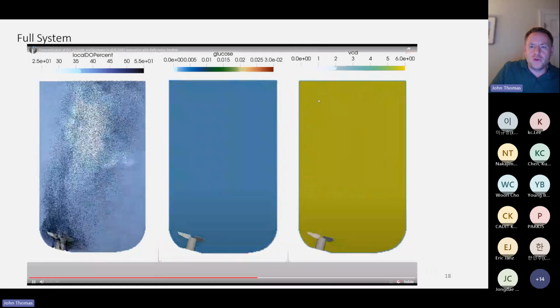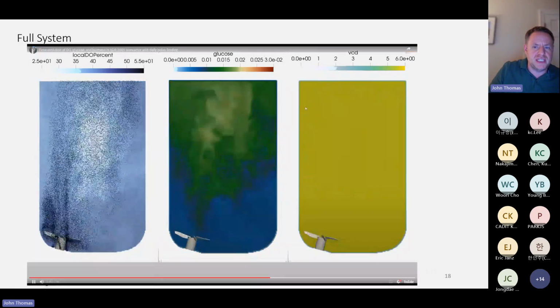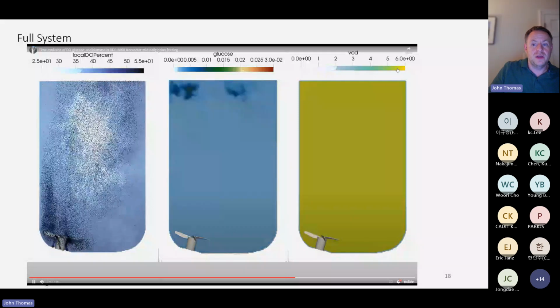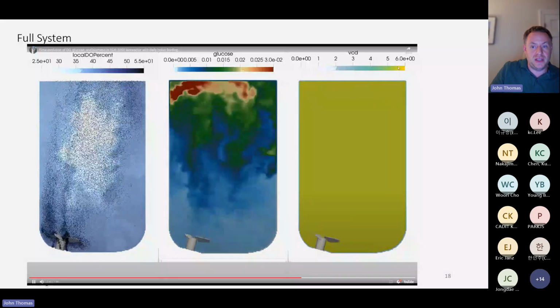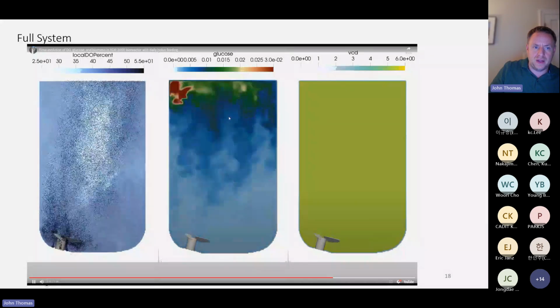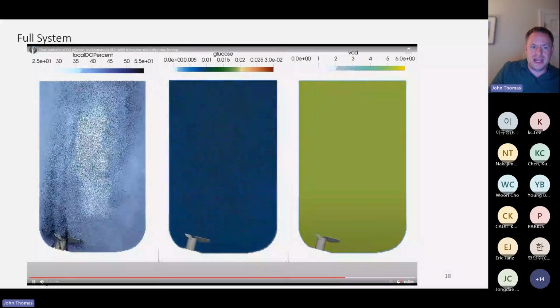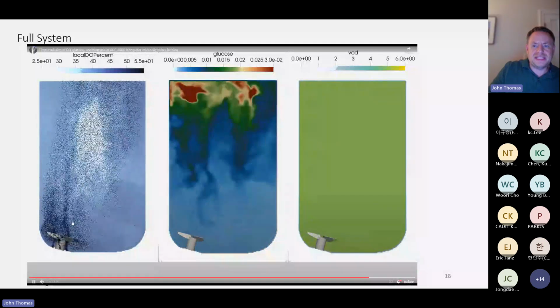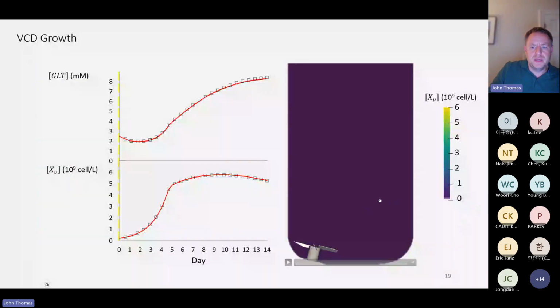Said again, although there aren't strong spatial variations in the viable cell density, we do achieve a target value. The target value we achieve is a function of these underlying feeding profiles, target concentrations, and DO PID control. We can look at these on a case-by-case basis as well.